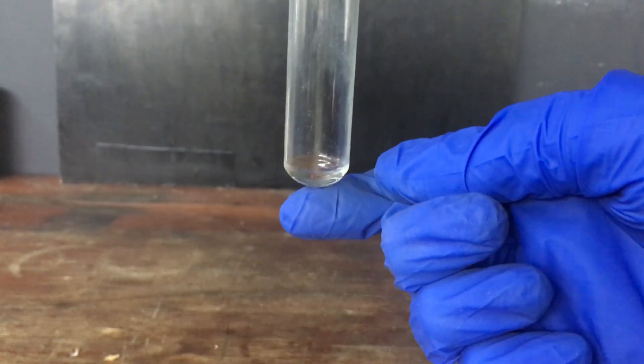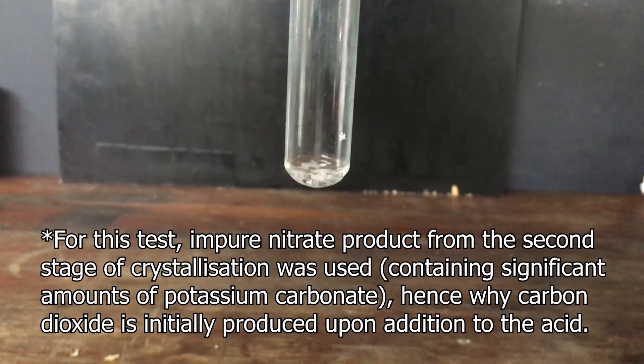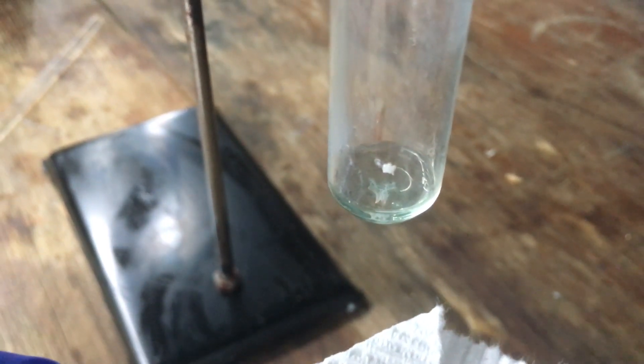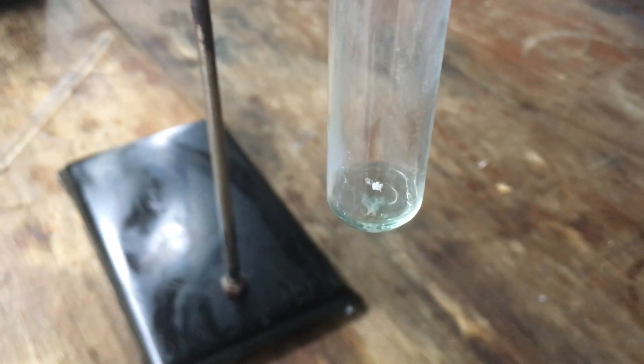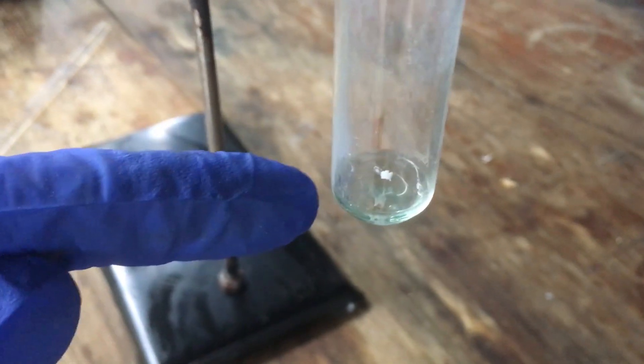To test for nitrate, what I have here is a small amount of copper in a really small amount of dilute sulfuric acid. If I add some of our crude potassium nitrate, we should see that the copper will react with the solution if nitrate is present. And yes — if you look closely, that copper is definitely reacting with the solution, so that is definitely a positive test for nitrate, and it definitely smells like nitrogen dioxide. I'm going to take that as a definite confirmation that what we have here is potassium nitrate.